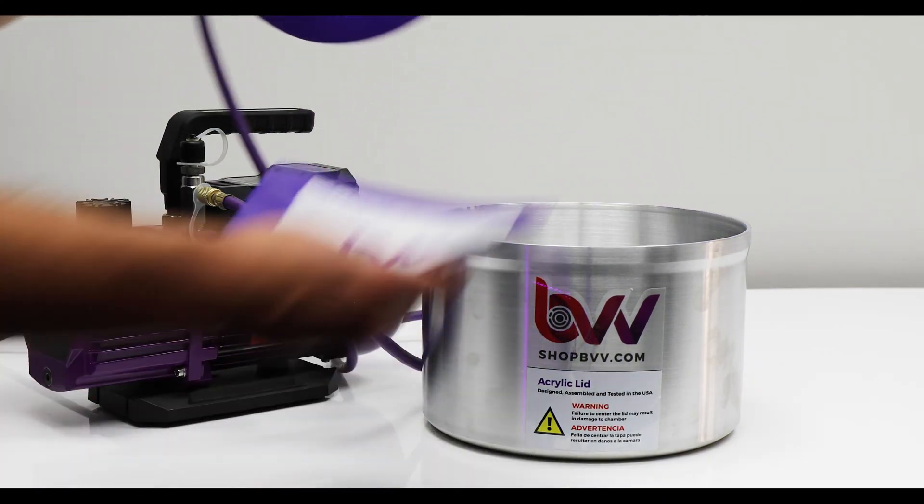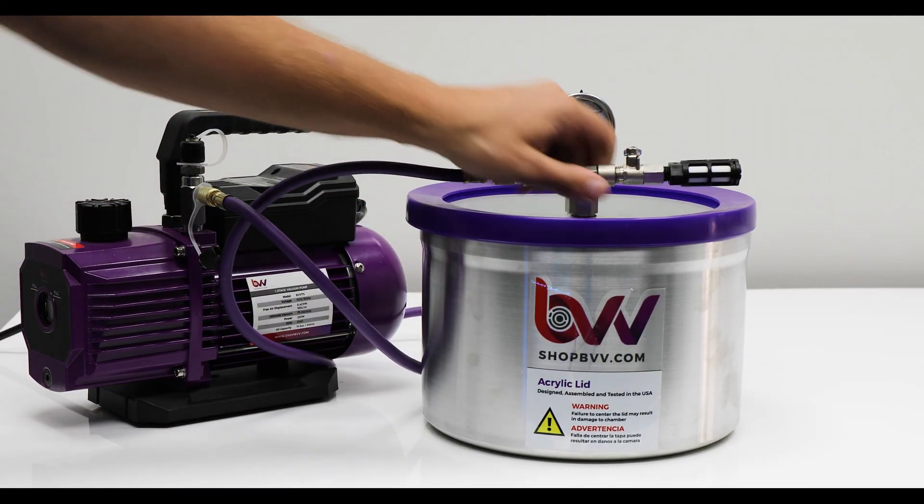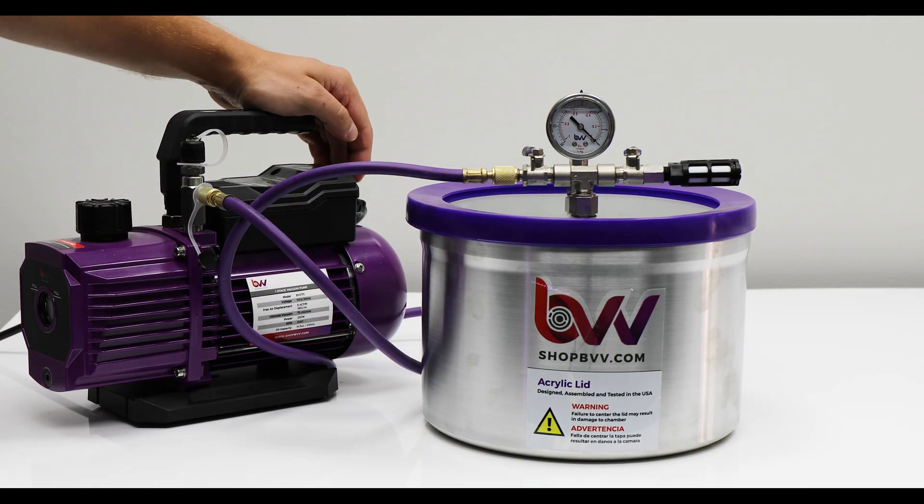Now your chamber is tested. Put in your sample and do the exact same steps. You're just going to close off the air in valve from the filter side and open up the vacuum pump lines again.